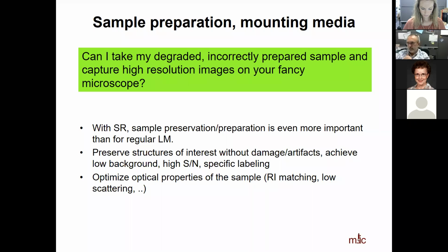The other would be the STED system on our machine. You would get the XY, if you use the right dye, something like 650, 640 nanometer excitation, or 590. That would give you XY super resolution, but not in Z. So you would still be limited to regular confocal resolution there.